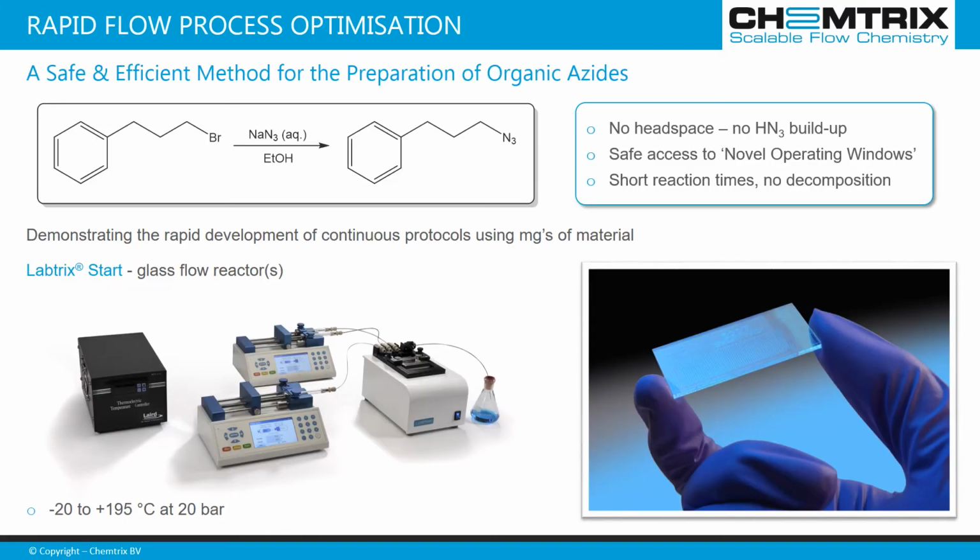I hope what you've been able to see so far is the differences between using PAT tool for optimization and for control purposes. And what I'd like to give you now are some examples of how we've used PAT in process development. Firstly, to gain process understanding, and then in the translation into larger kilogram and ton scale production.